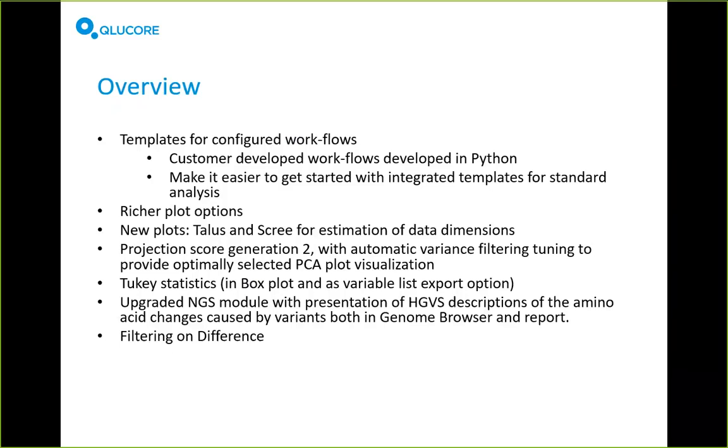Also, we have added much richer plot options, so you can configure your 2D plots a lot more. That's quite a big addition to the software as well. We have two new plots, Talus and Scree. The Scree plot is well known since before. However, the Talus plot is something new that we have developed. I'll just show them briefly today. There will be a lot more about this in later webinars.